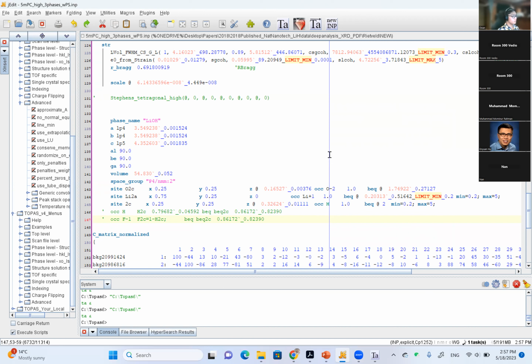Lattice parameters. We only need your lattice parameters, including both a, b, c and alpha, beta, gamma, coupled with the space group, and then you know the position of the peaks. And your intensity is approximated by a pure mathematical function. It is not correlated with the structure at all.